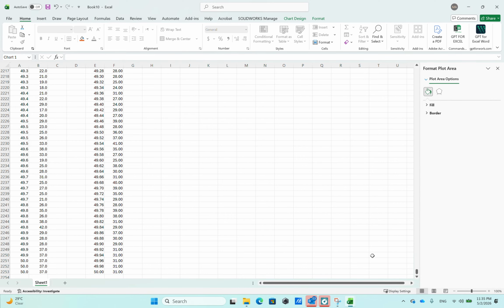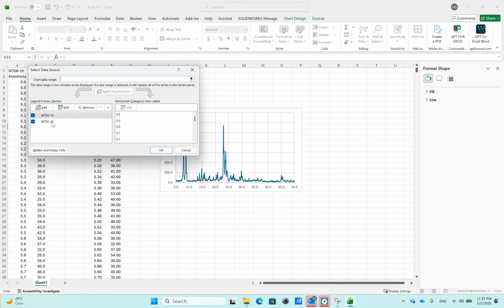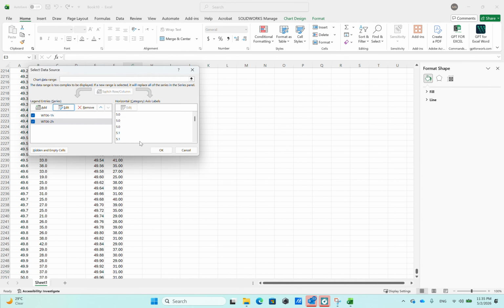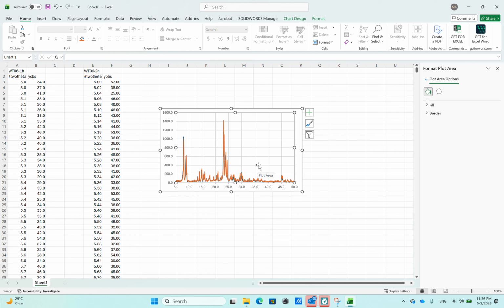Okay. You see how simple it is to collect this data. Okay. Okay, now you can see two colors overlapped, indicating we have two patterns.